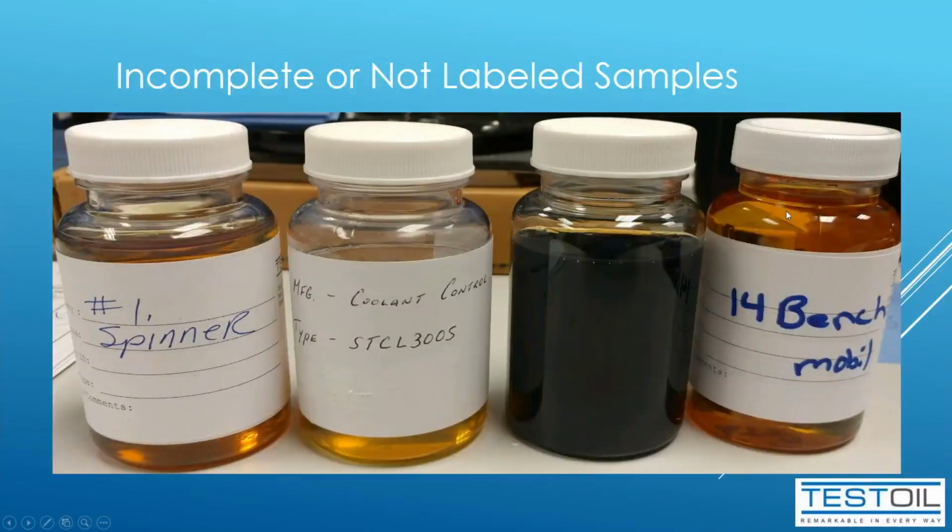Okay, as you can see from this slide, a lot of the information is missing. You will most likely be receiving a phone call on any of these samples, needing additional information or a resample due to lost fluid before we can get these into the lab. I mean, as you can see here, there's no lubrication information. And on this one, there's just no information at all. And you wouldn't believe how many times we see this come in.